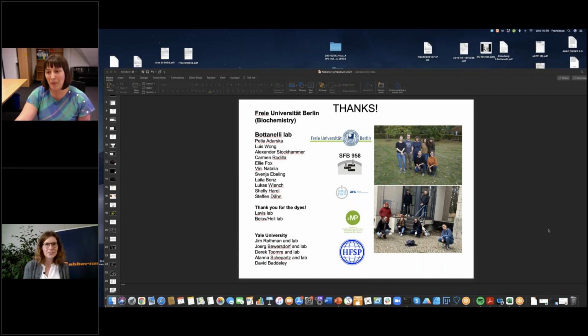Okay, thank you for your answer. I haven't tried the halo so far, I've only experienced the snap tag. Another question: on average, how many frames can you record before you experience photobleaching? It really depends what you're looking at. For example, if you're dealing with overexpression, I would say you can go hundreds and hundreds of frames.